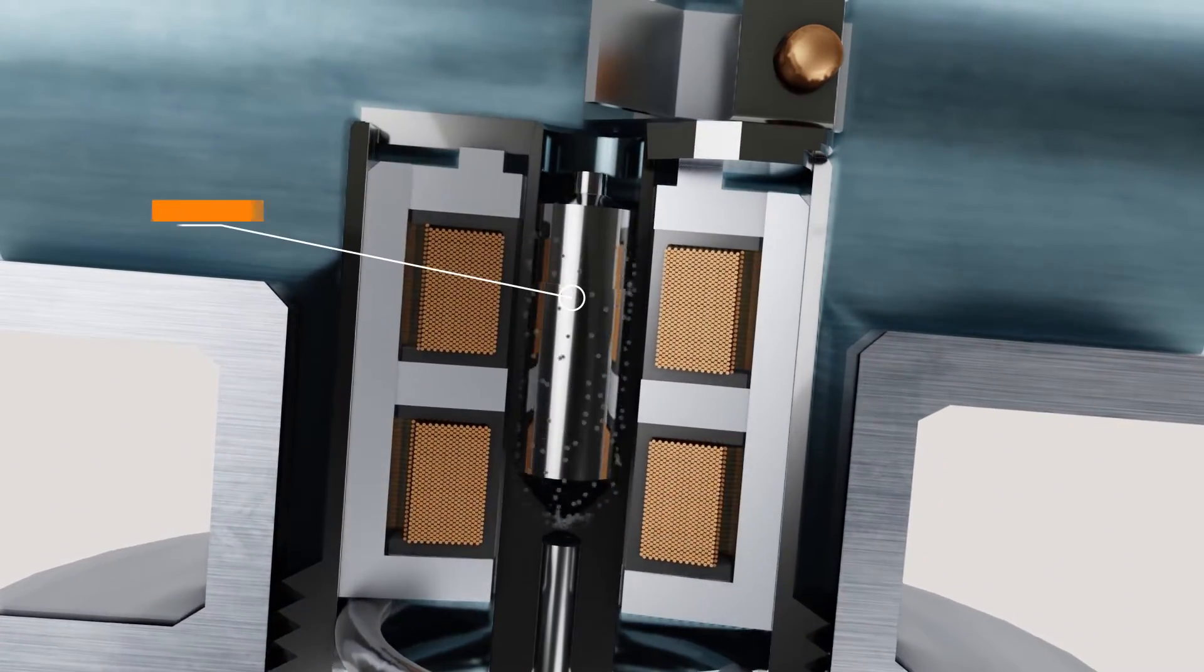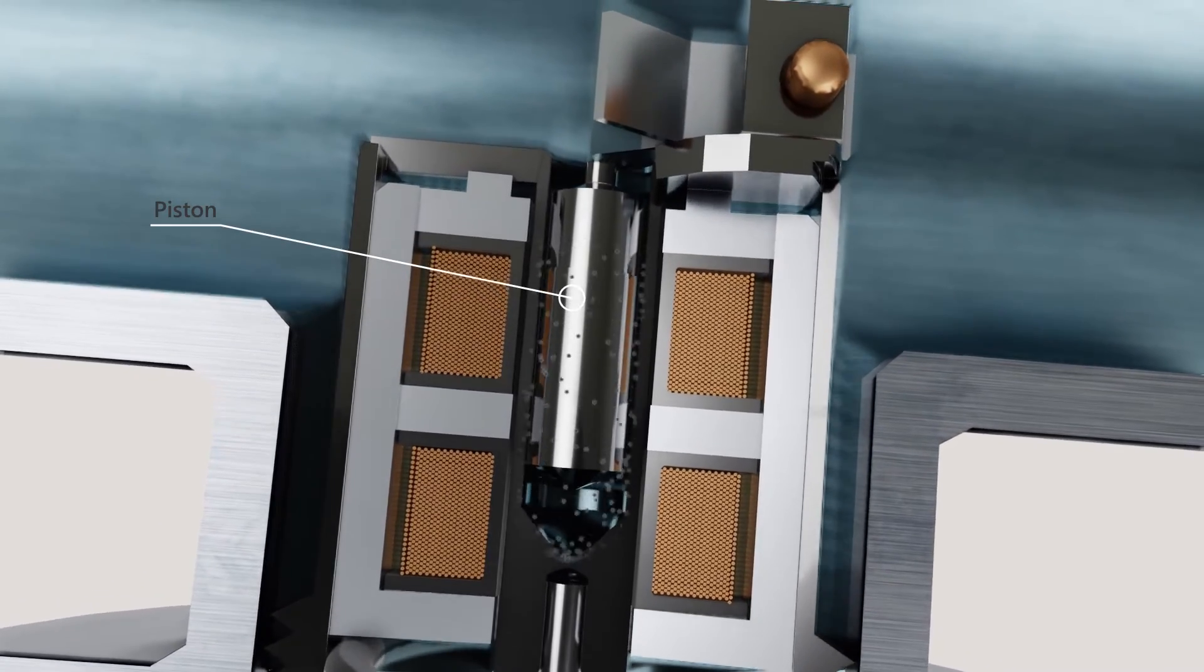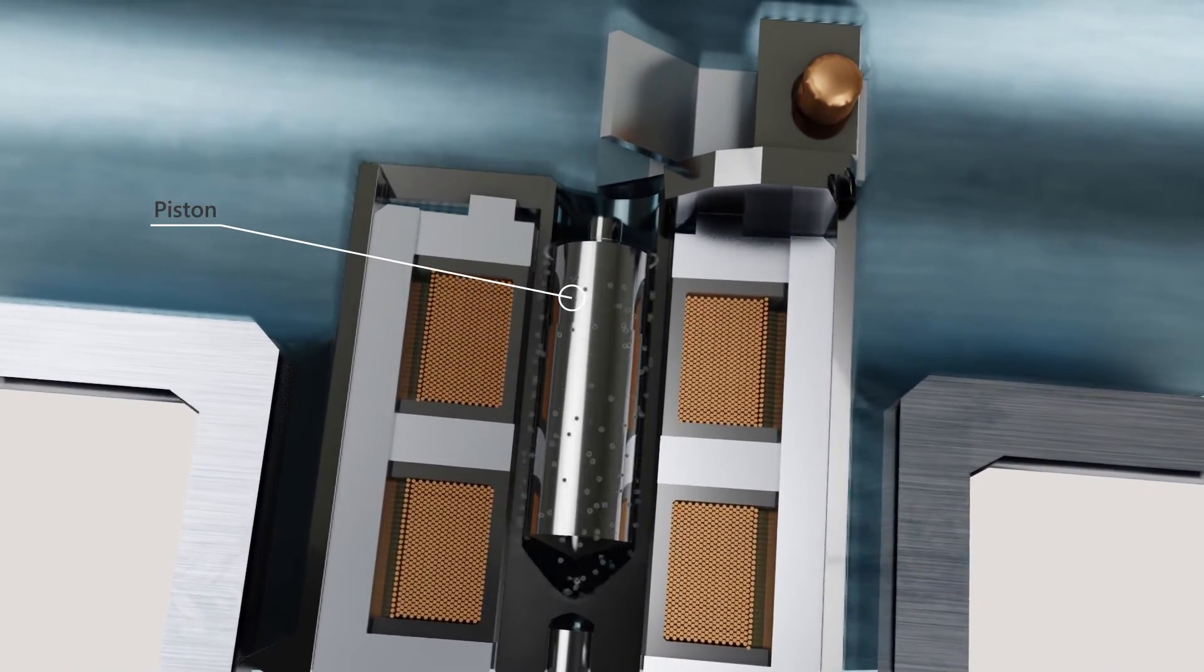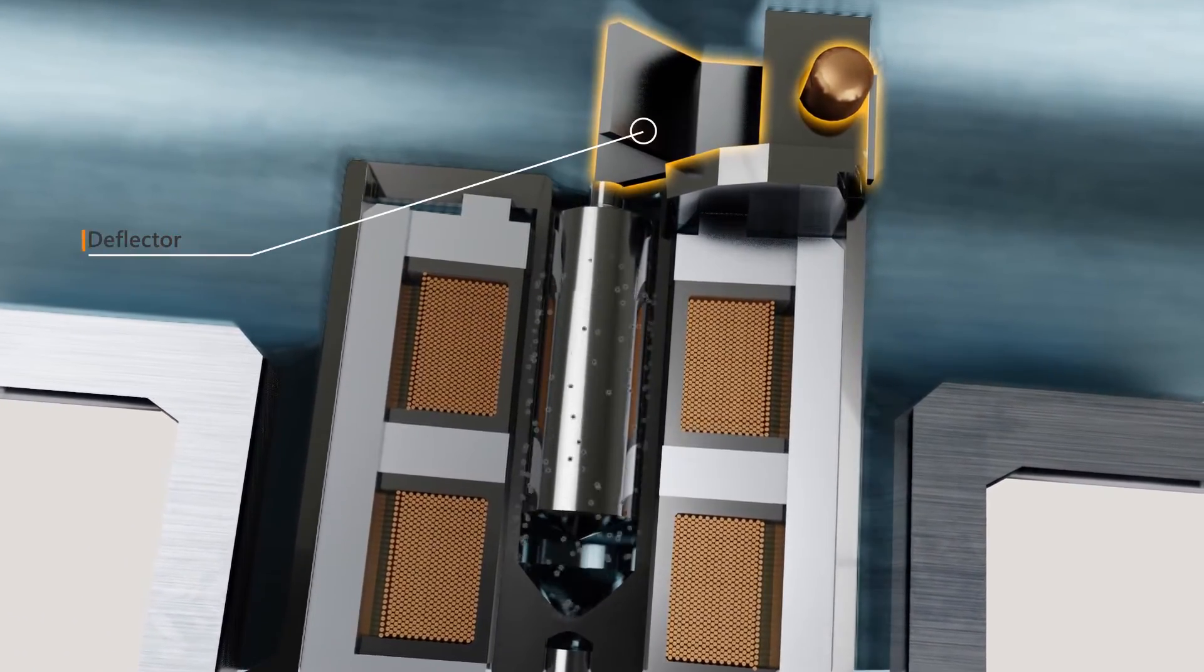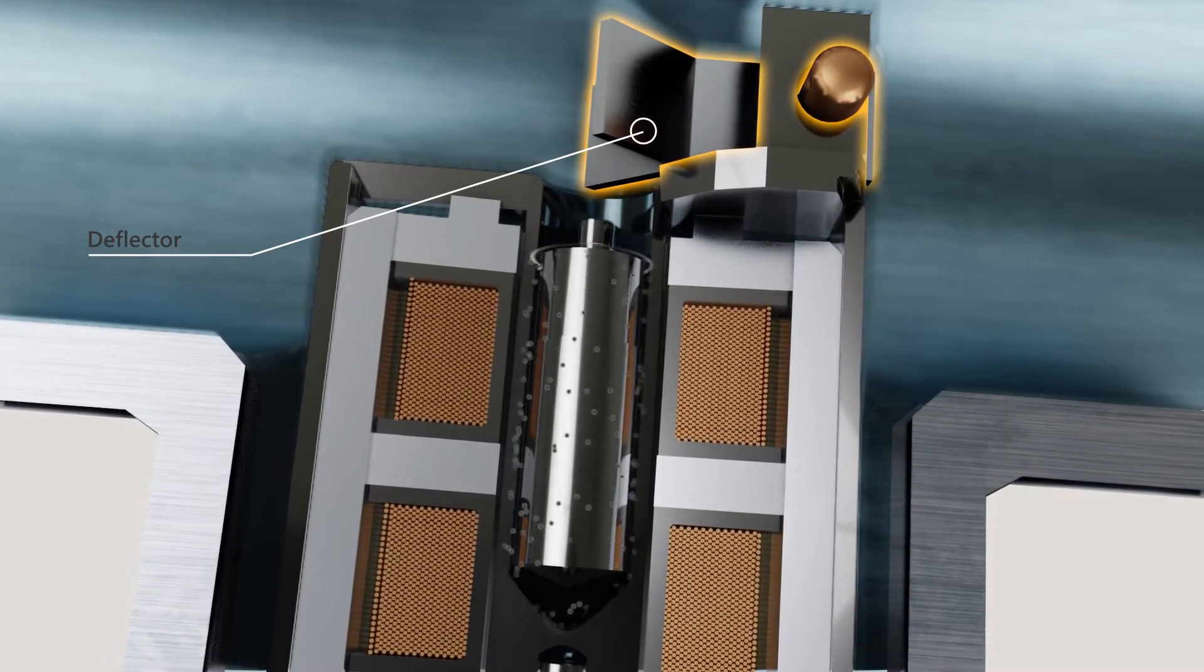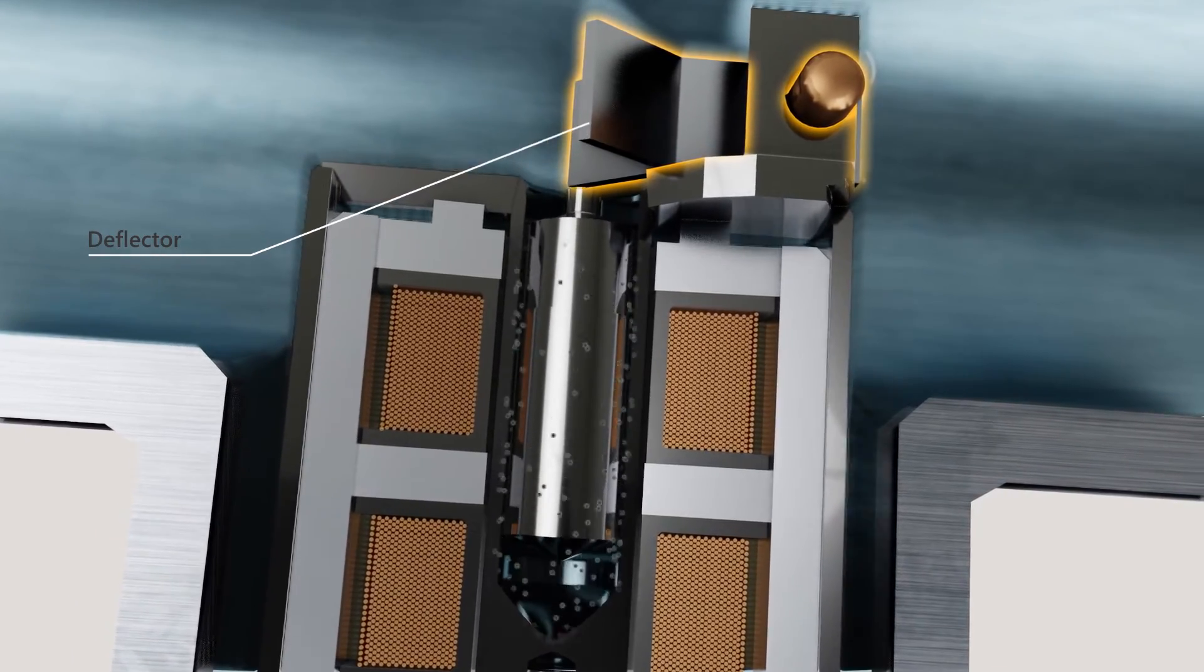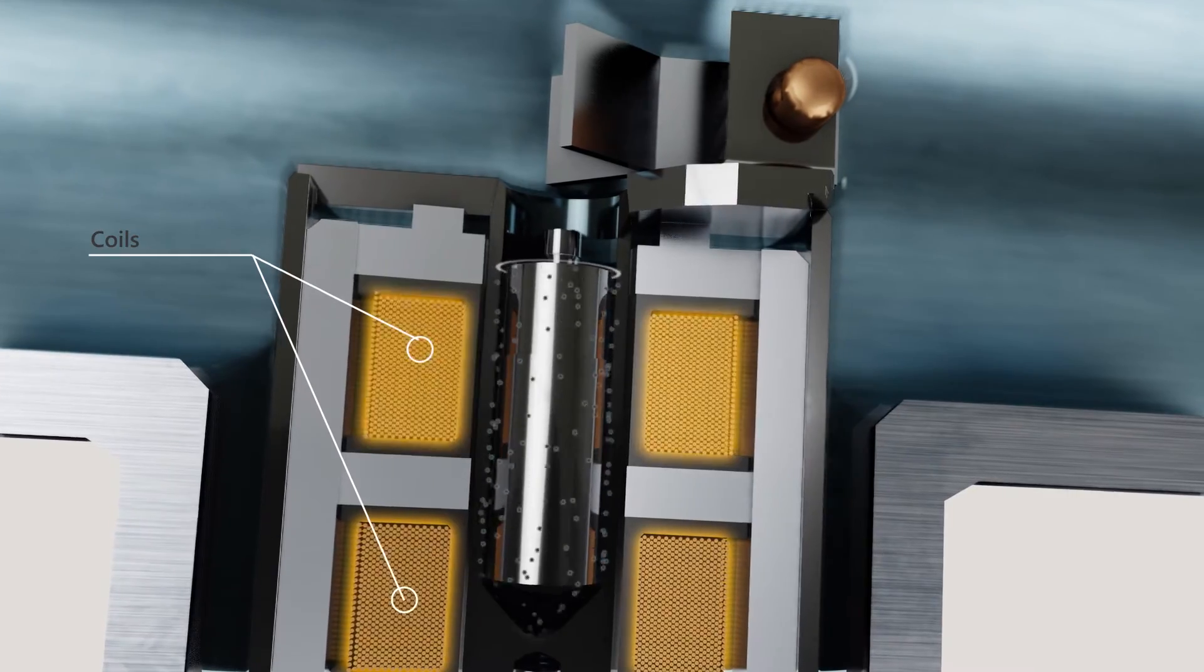a piston is driven electromagnetically through the fluid inside the measurement chamber at a constant force. A deflector positioned over the piston moves fluid into the measurement chamber, while two coils move the piston back and forth.